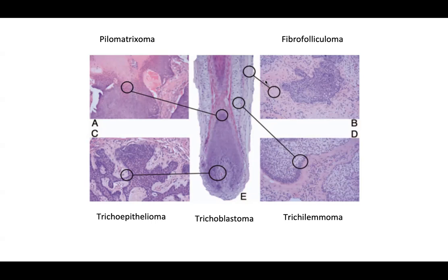Fibrofolliculomas are more differentiated from the outer fibrous sheath of the hair follicle. You do have areas that look basaloid, but there's also a lot of fibrous stroma and maybe some fibromyxoid stroma. If you cut a fibrofolliculoma in a different section, it's thought that trichodiscoma and fibrofolliculoma are essentially the same type of tumor. So if you rotate it and cut differently, you may get mostly fibrous stroma — that's going to be more of a trichodiscoma.